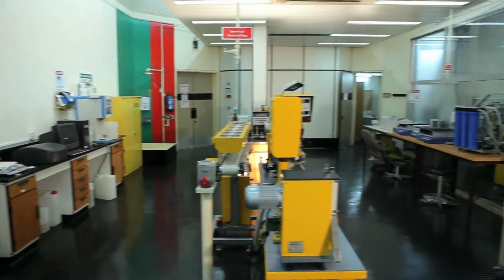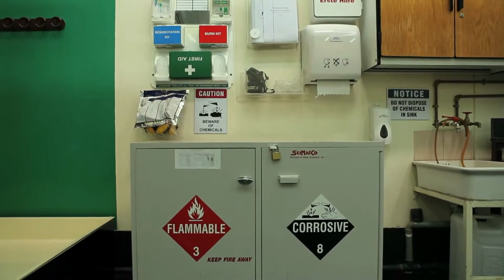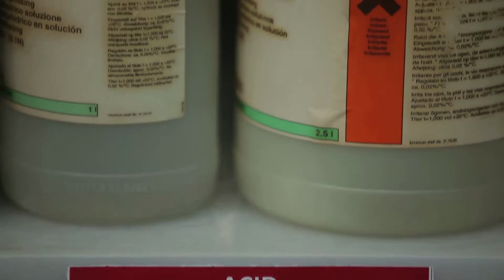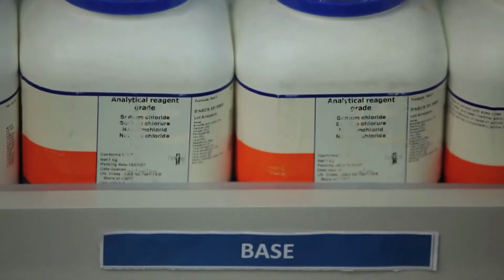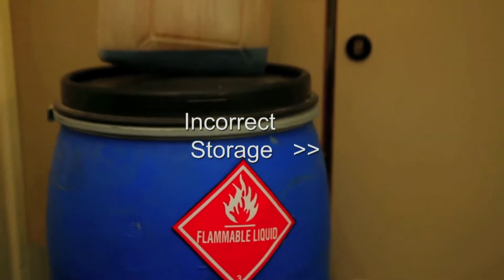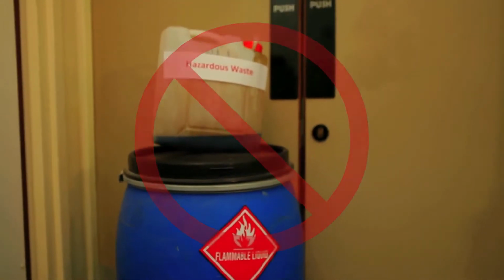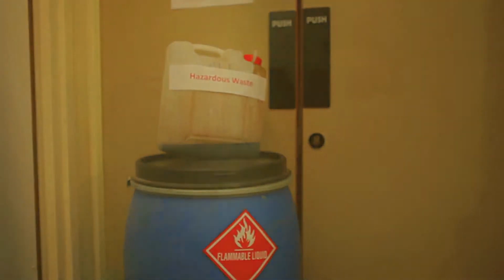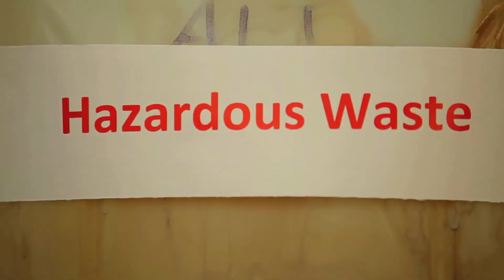Storage of chemicals and flammable or combustible liquids requires specific attention. Acids and corrosives must always be stored in an acid corrosive cabinet. Store acids in secondary containment, separate from bases. At any given time, no more than 10 gallons of flammable and/or combustible liquids may be kept outside the storage cabinets in laboratory areas. The vapor content in flammable material containers may still pose a potential hazard. Therefore, properly dispose of all empty or unnecessary containers in the lab.